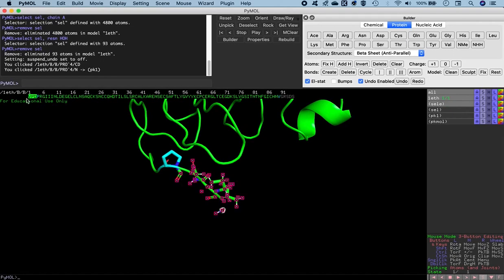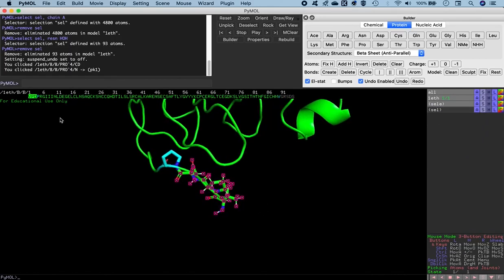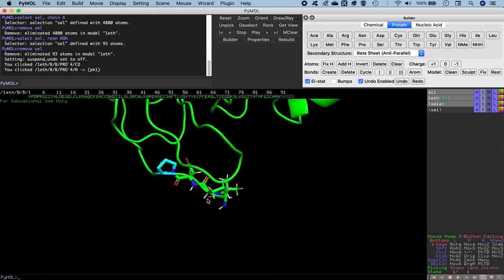And you see all the gray regions have disappeared and they have been replaced by the green regions, which means the structure, or let's say the loop region, has been formed in here. So once we select the first three residues that we just built, we go to the selection again and show it as licorice representation. And now you see both the cartoon format and the licorice format are represented properly. So you see this loop region has been built. Okay, so we are done with the N-terminal. The N-terminal missing residues have been built.